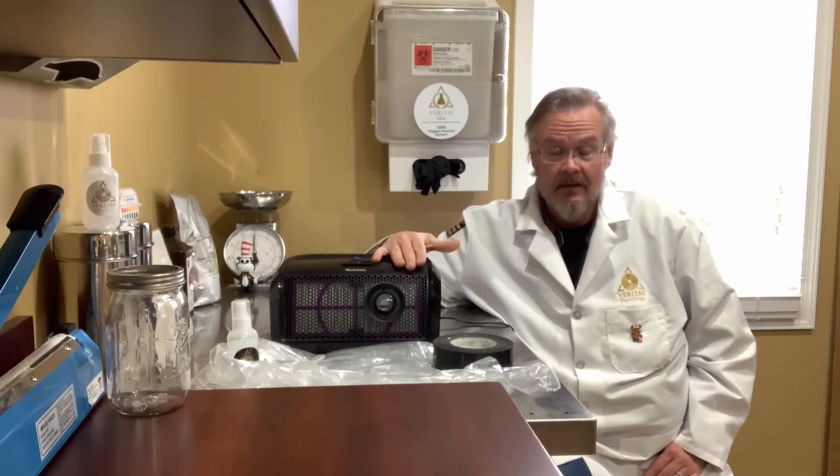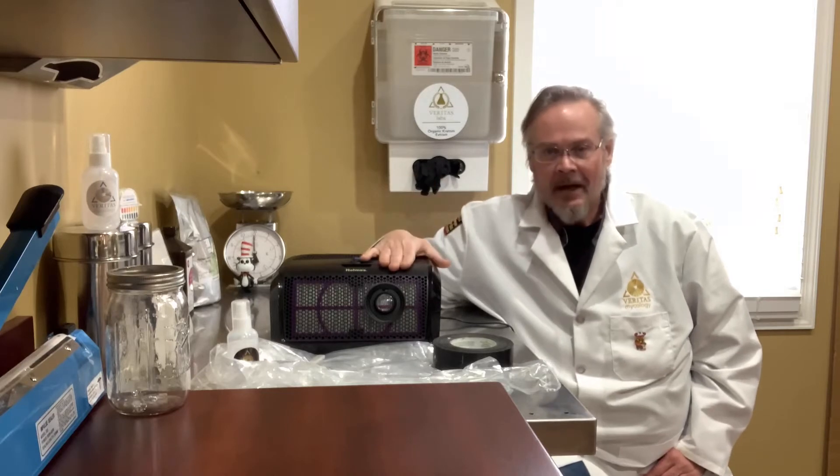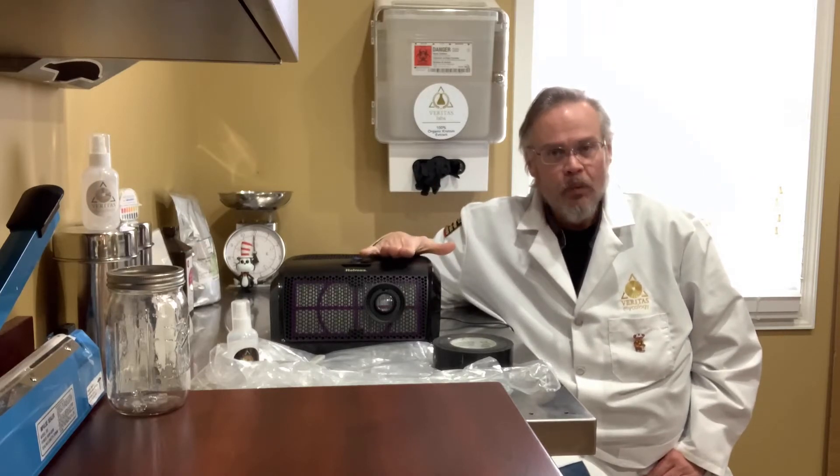I can't promise you it's going to be 100% safe — it's going to depend on you and several environmental factors, an infinite number honestly. But this should work for you. It's much better than a still air box in my opinion, and that debate goes on and on.